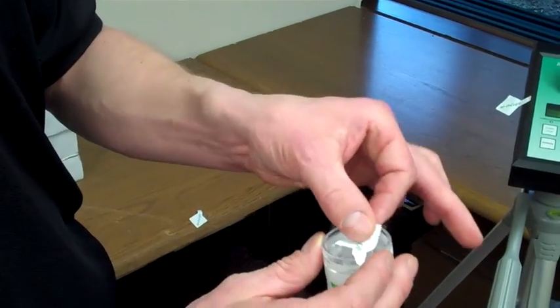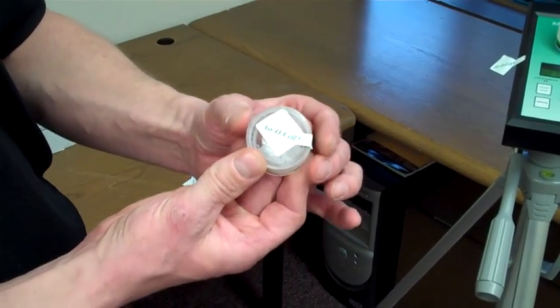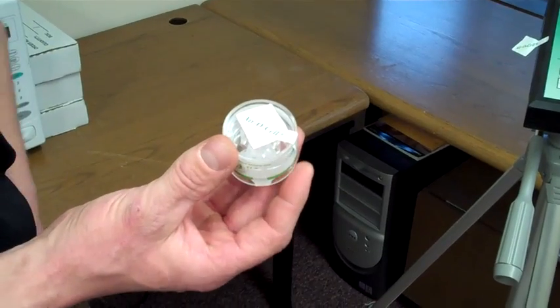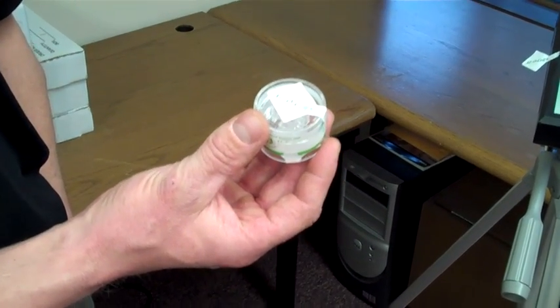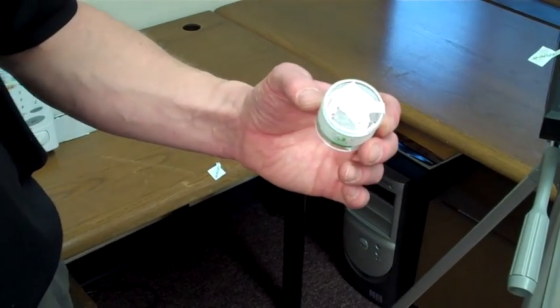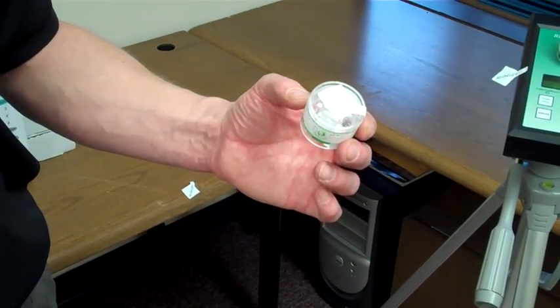They will specify what types of molds were within the air as well as the quantities. These types and numbers will then be compared to an outside sample collected at the same day and time. When comparing the two we will be looking for spikes in the quantities and or types of mold as compared to our outdoor sample.